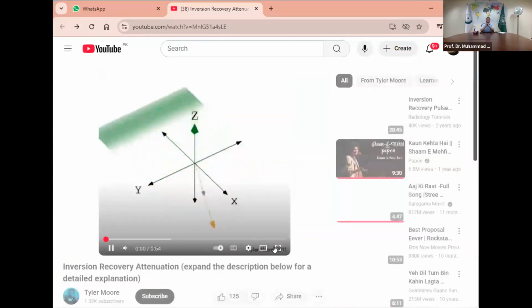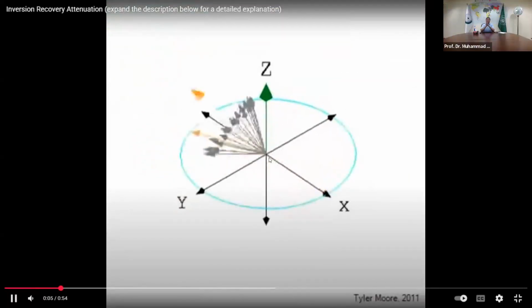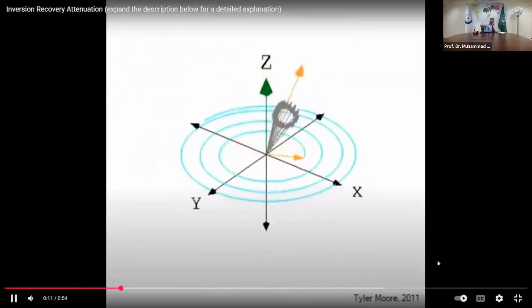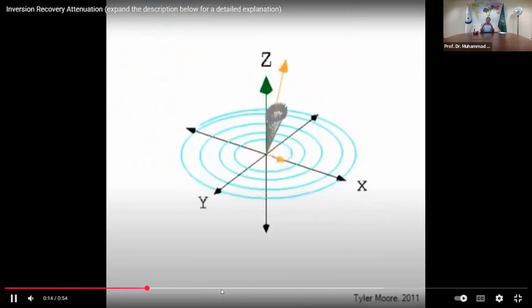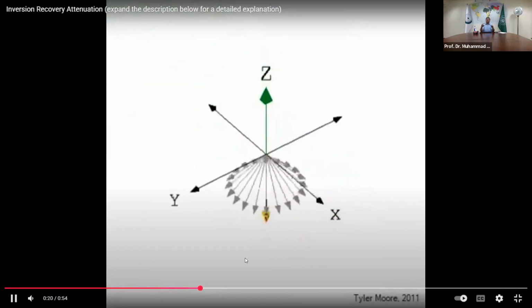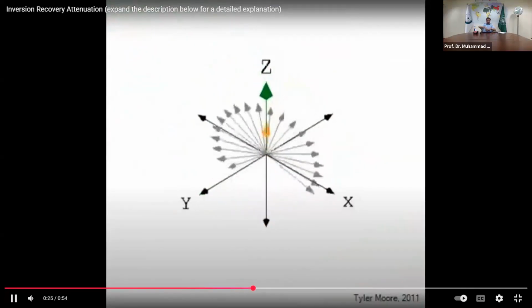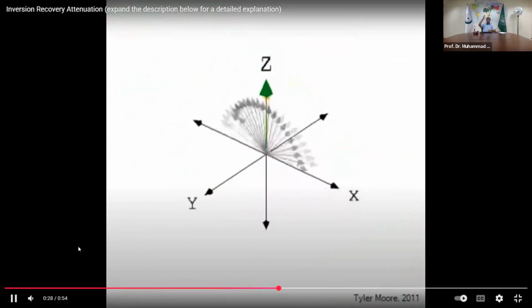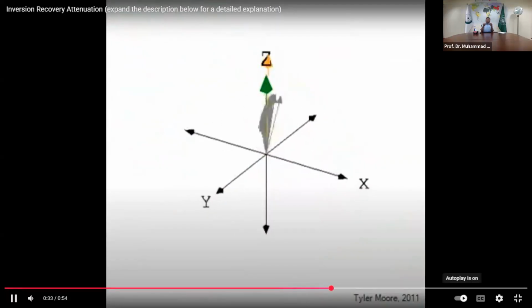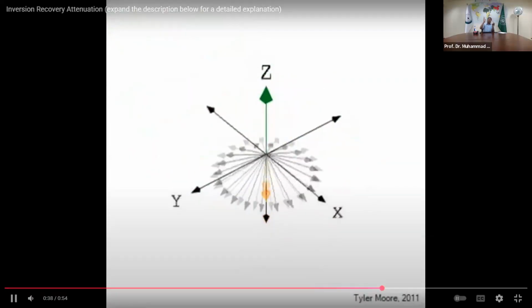It's not a spin echo, Atya. This is inversion recovery. This is what is recorded, and you measure from full minus z to plus z by using the second pulse, and this second pulse brings it to the xy plane. So you see the umbrella moving from full negative to full positive, as you have seen in my slide.